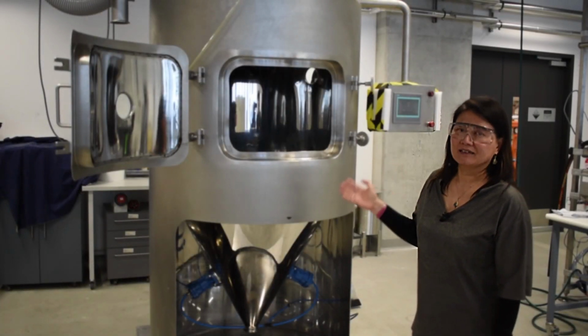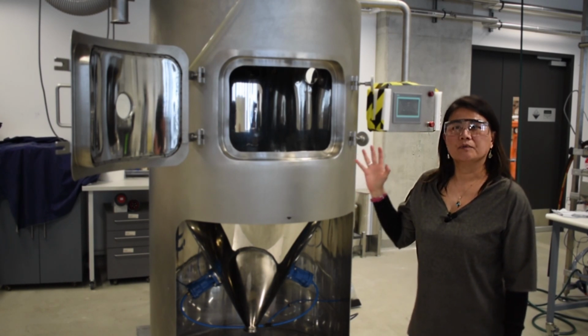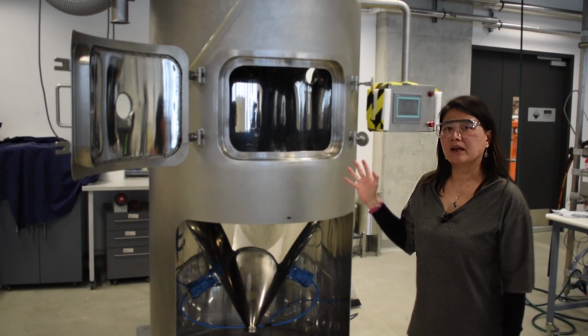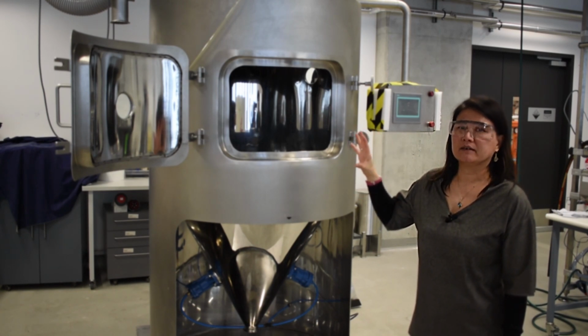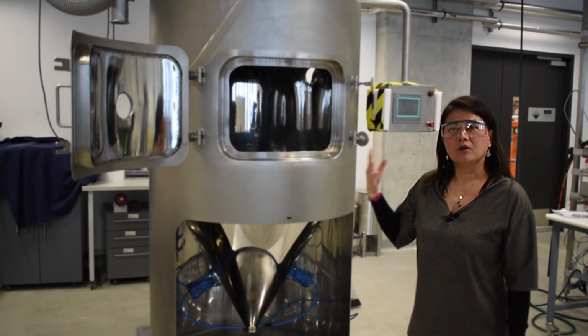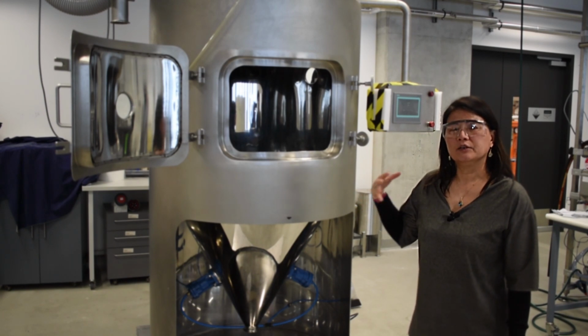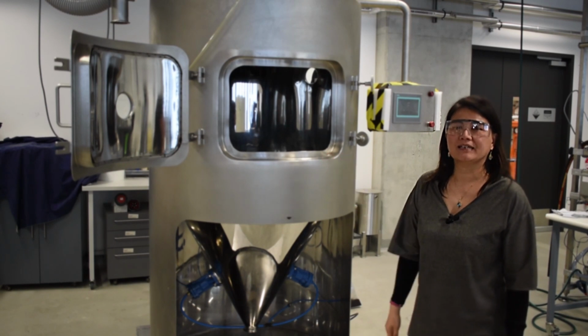This is a pilot scale spray dryer. It's a small version of a typical spray dryer that we encounter in industry. It uses a centrifugal atomizer to generate droplets that will be turned into powders. And we use this dryer mainly to generate small samples when we want to test new formulations before we go into the larger scale dryer in an industrial setting.